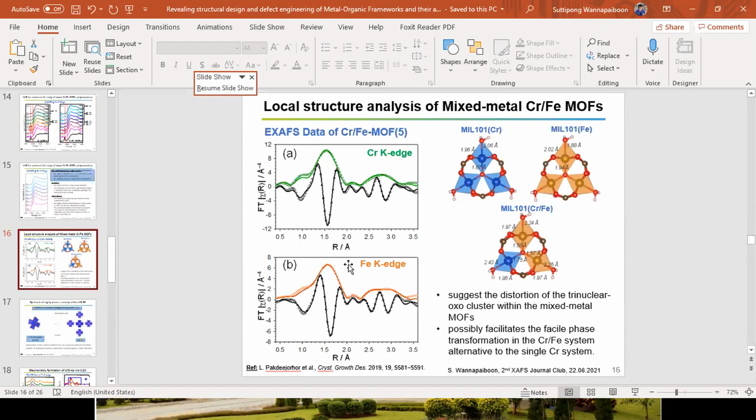And what about the second, higher shell? It looks to me like a real shell. Larger amplitude, yes. I mean the magnitude, not the real or imaginary part, but the envelope. Yes, this is also what we get from multiple scattering, together with the elongation of this bond.